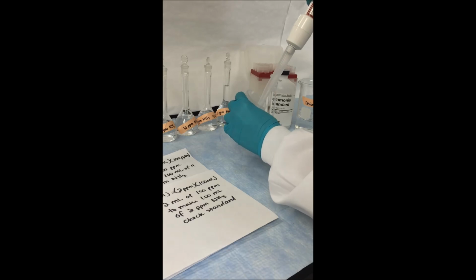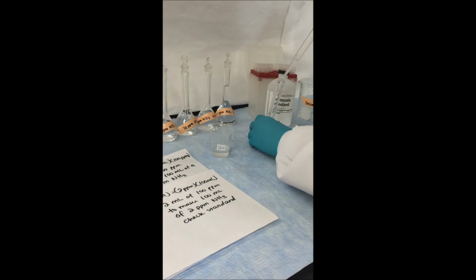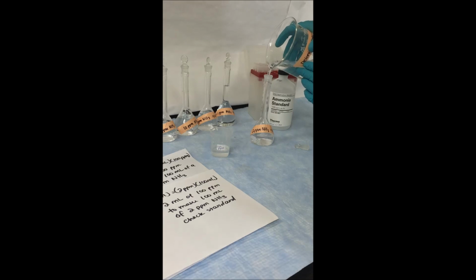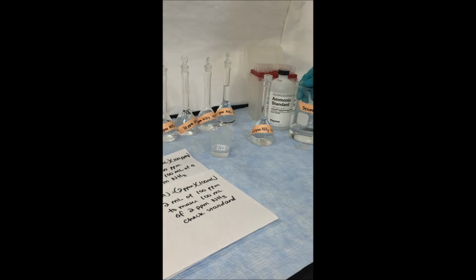Running a check solution is a way to validate our previous calibration. If we aren't getting a recovery within 10% of the known concentration, we can go back and assess whether or not the calibration data is valid, whether our serial dilutions have been contaminated, or if we need to go ahead and troubleshoot our electrode.